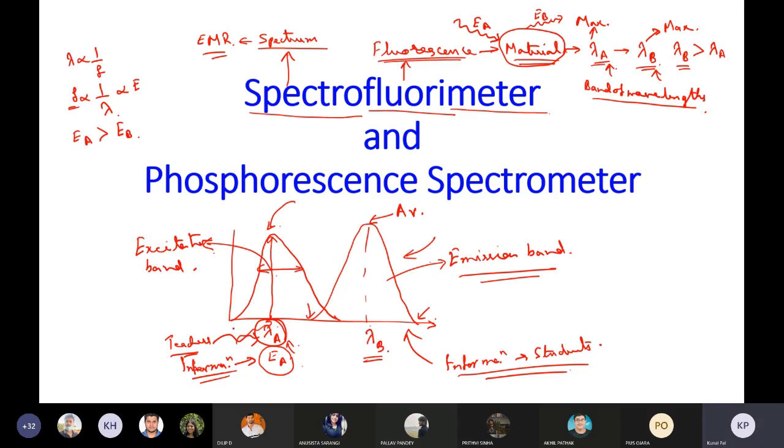it has more information, and the information the students usually reproduce in their copies has a lesser amount of information, and this information is basically associated with the energy. So if a signal is giving higher information, then it is said that the signal has higher entropy, or in other terms energy, and if a signal has lower information content, then it is said to have lower entropy and lower energy.